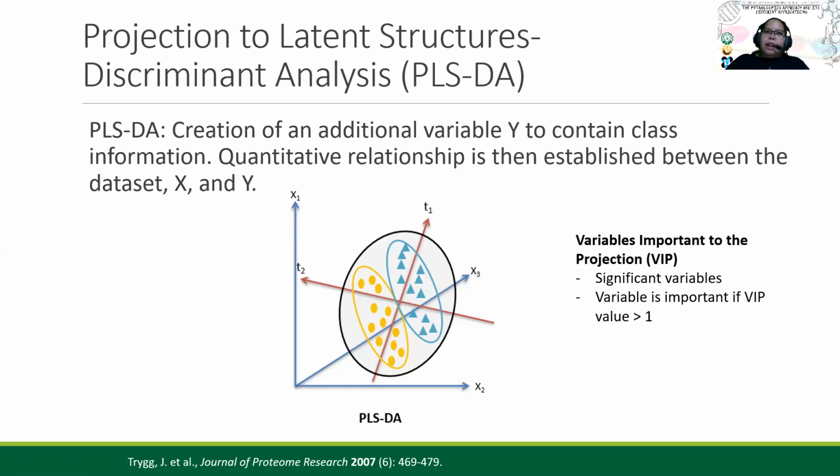You want to see if you have already established the model for your good samples as part of your quality control. You would want to see later on if you input data from different samples or from incoming samples, whether they can fit that particular model. So usually yun ginagamit.